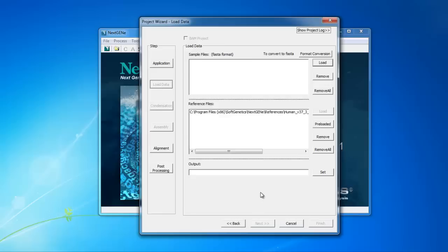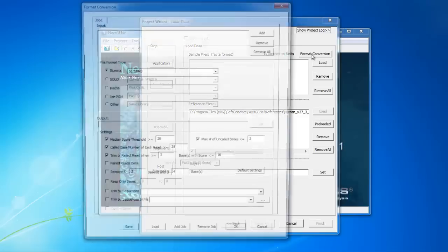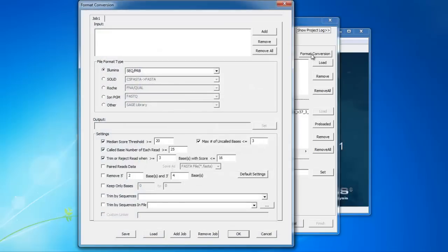On this page, we can load the sample file in FASTA format. To convert to FASTA format, click the Format Conversion button to open the Format Conversion tool.